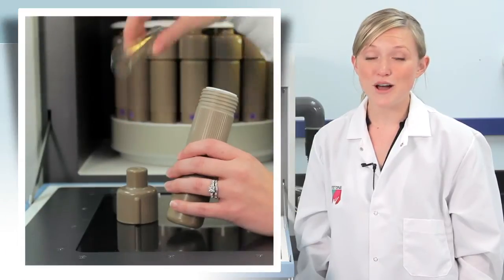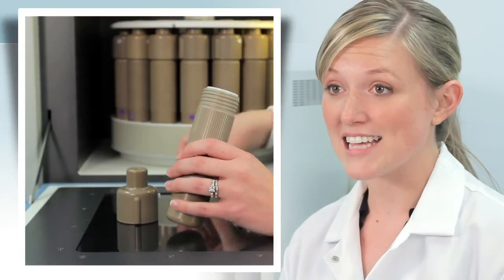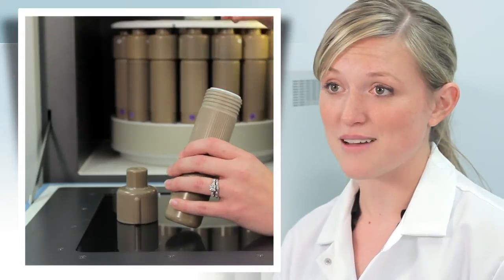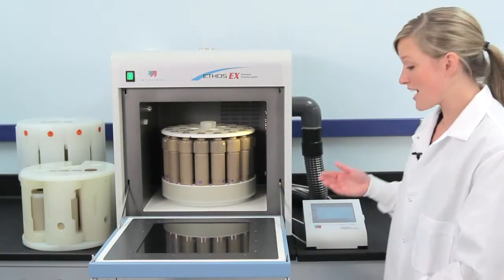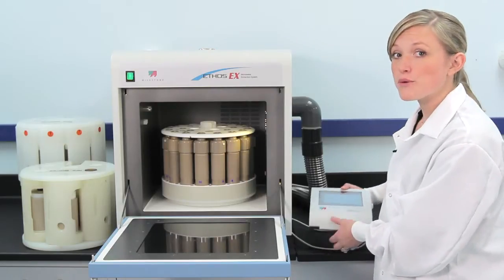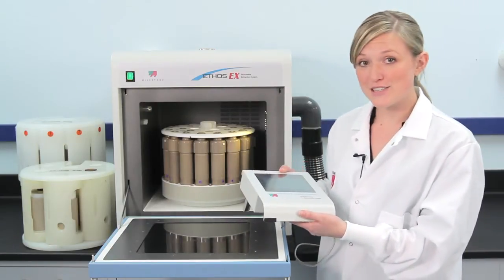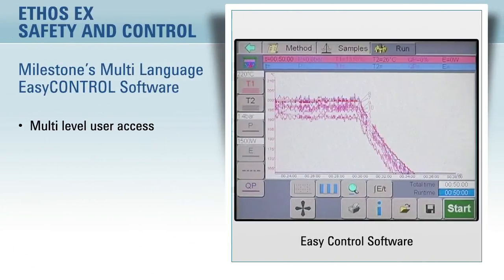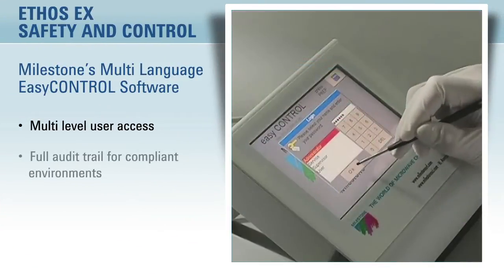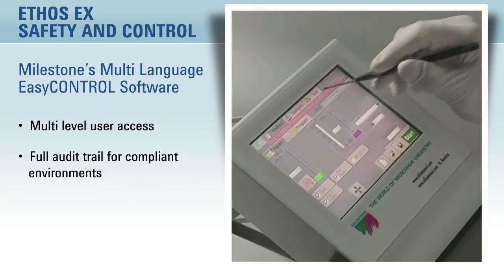Milestone also offers a throw-away glass vial for high-throughput labs. The Ethos EX is controlled by a color touchscreen terminal, which runs Milestone's Easy Control software. The software features multi-level user access, as well as a full audit trail for compliant laboratories.